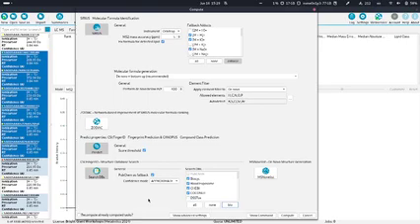And I mean, that's something everyone does if you really want to do annotation, like in CASMI 2022, I think. It was the key thing we did to get these good results. First search in bio databases and only search in PubChem if you don't find a good hit in a bio database. And I think it's a really big thing that it's now automated, this process.